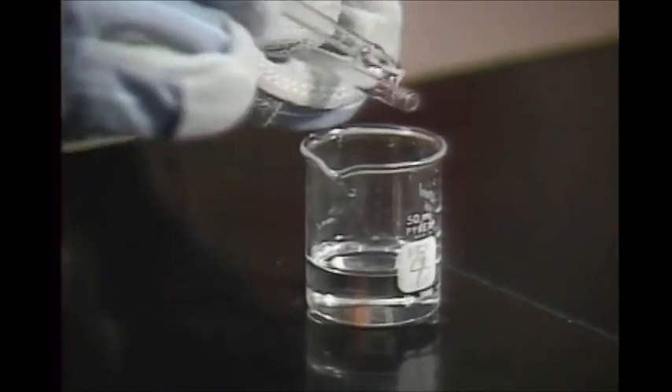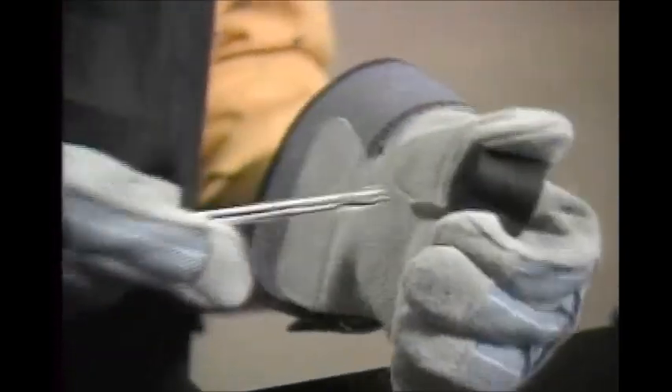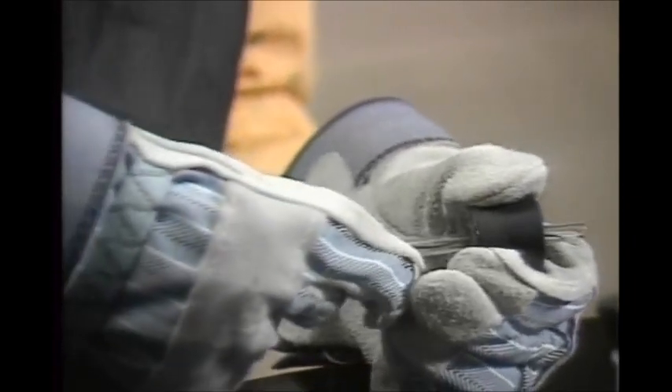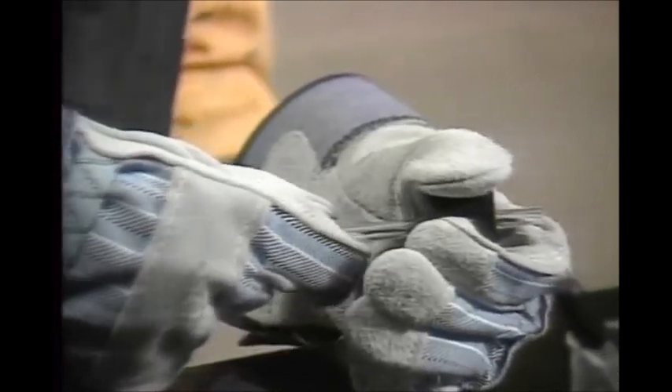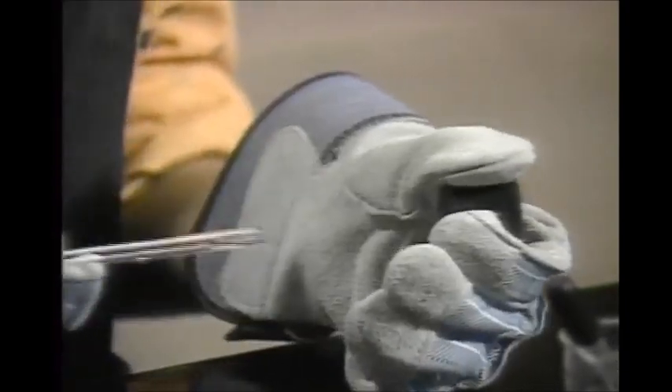If you don't have an inserter, lubricate the tubing instead and protect your hands with leather gloves. Push the tubing gently through, and rotate it if there's any resistance. Use the same care when removing it, and don't forget to wash off the lubricant.